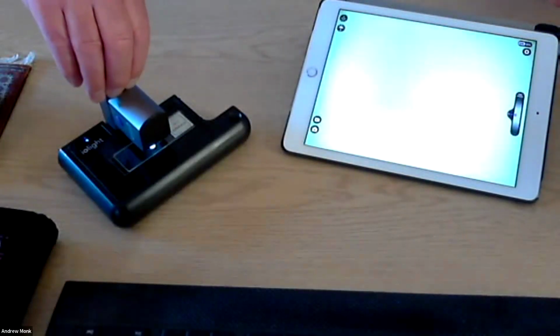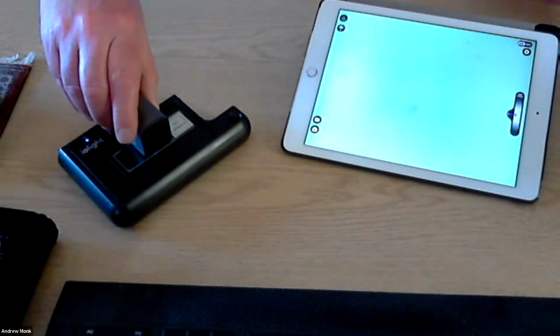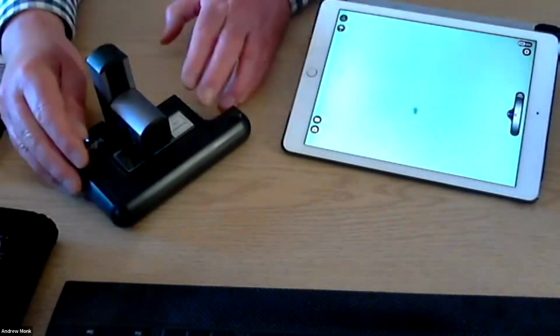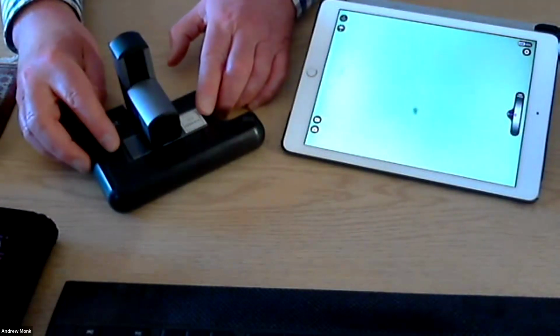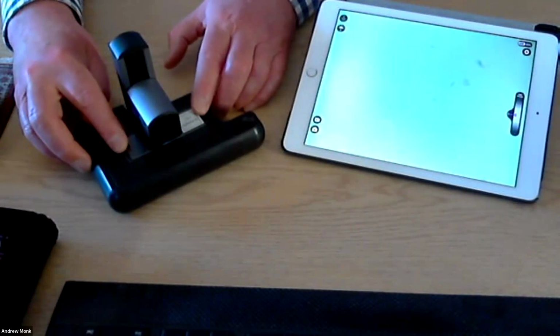I'm just going to focus down on the sample and start to look for the normal bits of dust and things on the slide. There we go. And now, using my fingers, because this is not an XY microscope, I'm just going to start wandering around the slide to see if, oh, there's something.